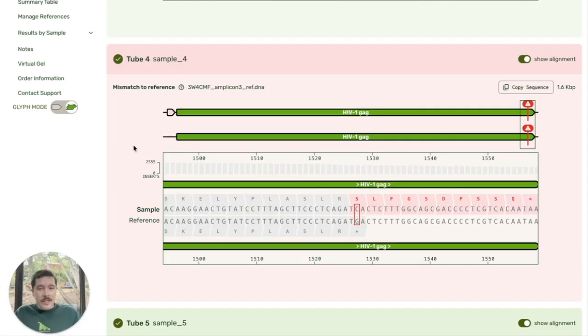And this is a great example of why we say you should sequence everything, because you just drop this in the Dropbox, and by the time you come into the lab the next day, we've sequenced this, you've got this result, and you can look at this and say, this is misformed. I need to make it again, or I need to use a different plasmid, or whatever it is that you need to do, rather than spend days, weeks, months troubleshooting an experiment that was never going to work.